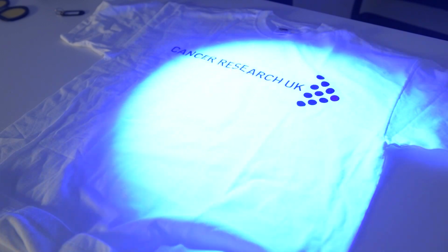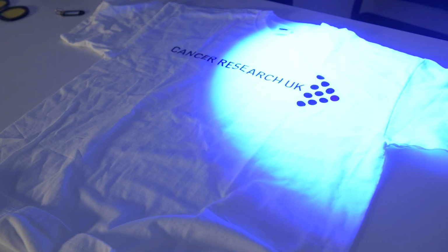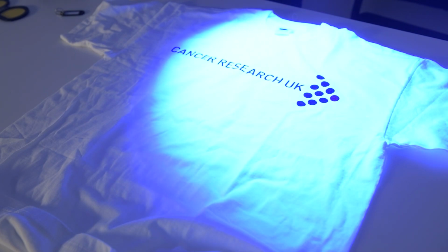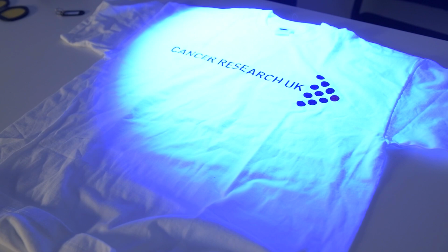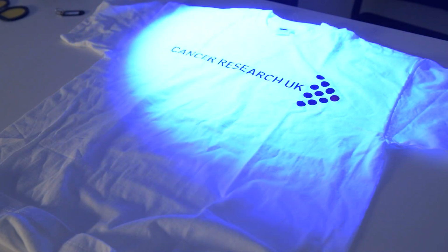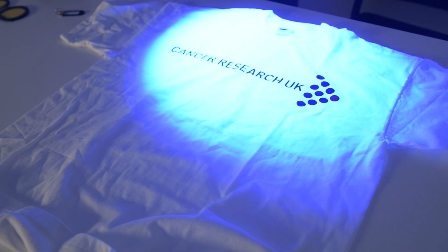We can't really see the area of interest because the optical brighteners in the t-shirt itself are emitting so much fluorescence that it's potentially overwhelming any signal from our ignitable liquid on this surface.